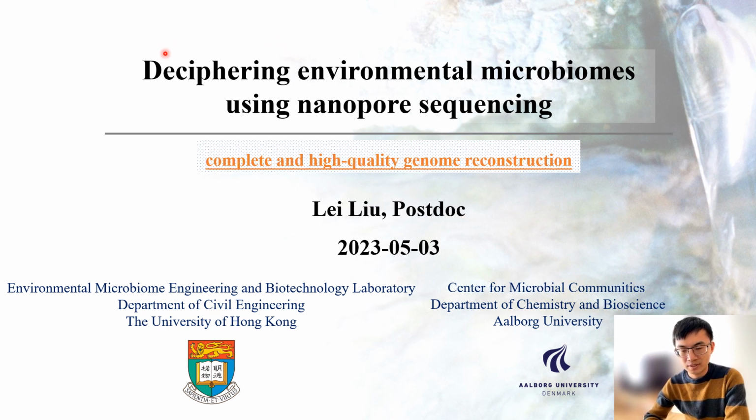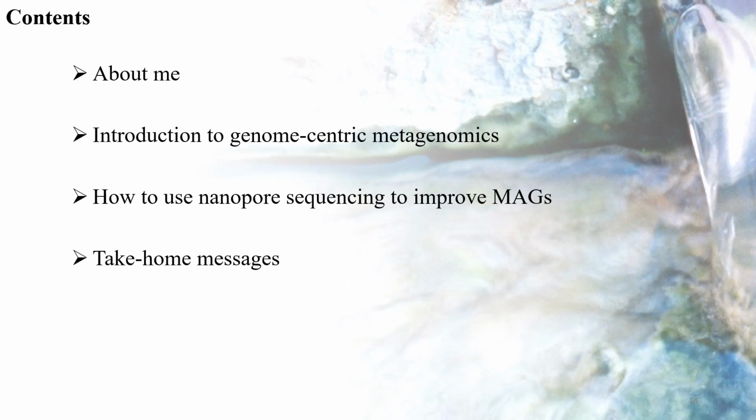In this presentation, I'm going to focus on the topic of deciphering environmental microbiomes using nanopore sequencing, specifically highlighting complete and high-quality genome reconstruction. Here are the main contents, including self-introduction and introduction to genome-centric metagenomics, followed by how to use nanopore sequencing, and take-home messages.